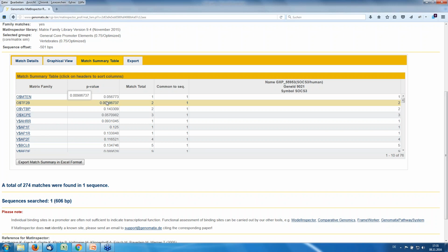The promoter background for vertebrate binding sites is all promoters for annotated human, rat, and mouse genes. For plants, it's Arabidopsis mainly, and depending on the origin, you have a different background. This p-value is useful mainly if you input several promoters from different genes. So if, for example, a set of promoters from genes that are co-expressed or have related biology, to find out whether potential targets of a specific transcription factor family are overrepresented in the gene set.